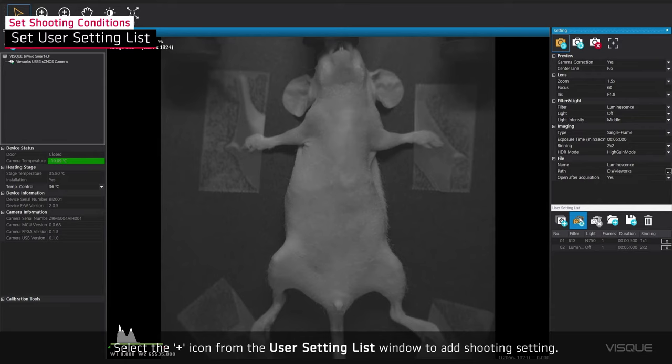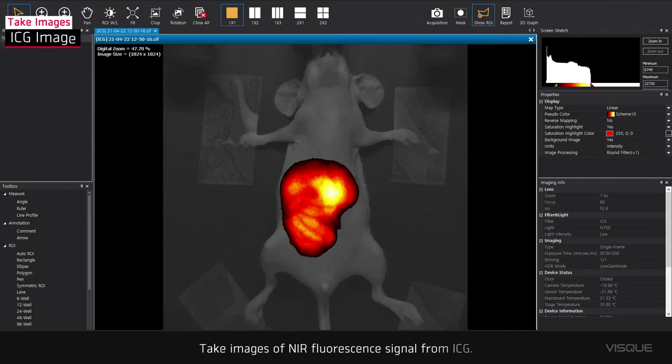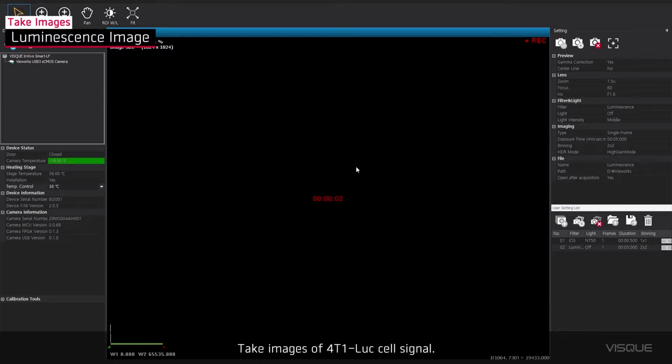Take images of NIR Fluorescent signal from ICG. Take images of 4T1 LUC cell signal.